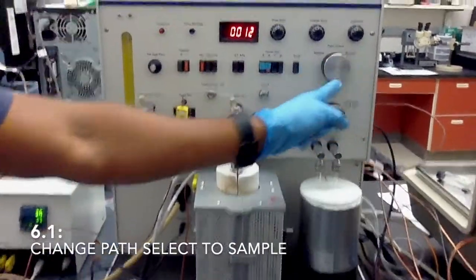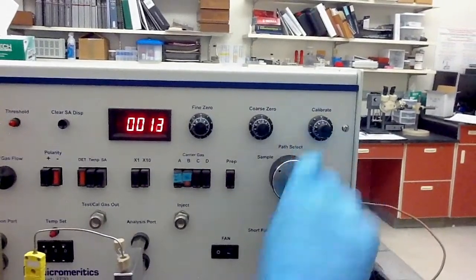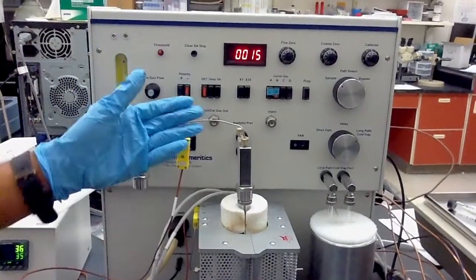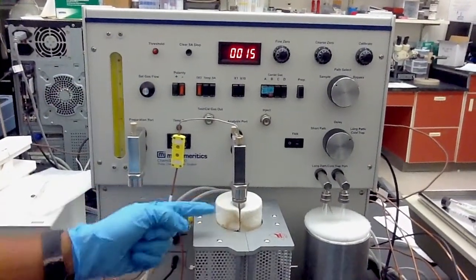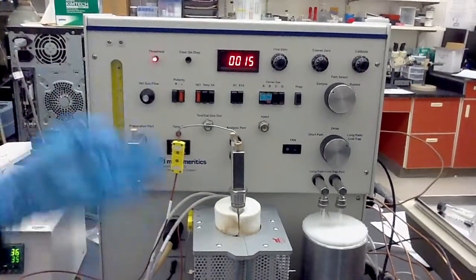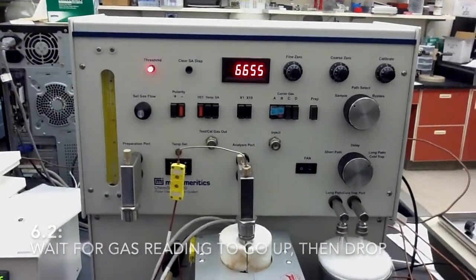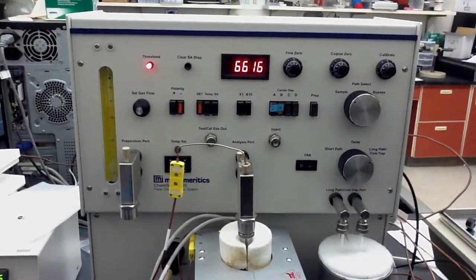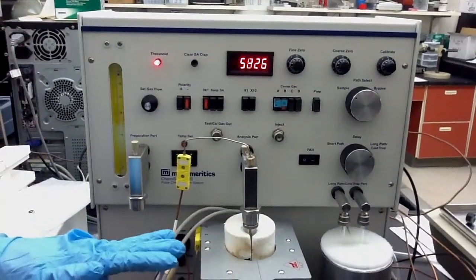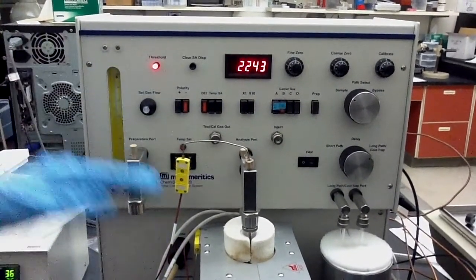Change the gas flow from bypass to sample. What we'll do, just move this back to sample. Now if you look in here, it will go crazy just in a minute because there is some oxygen in the tube. So when we change this flow, it will detect the change of gas here. So you can see it's already going up to 6,000 or whatever. After that, it will go down to zero or a stable reading, since all the gas is going out from the tube.